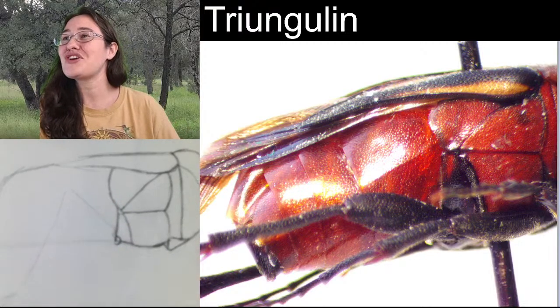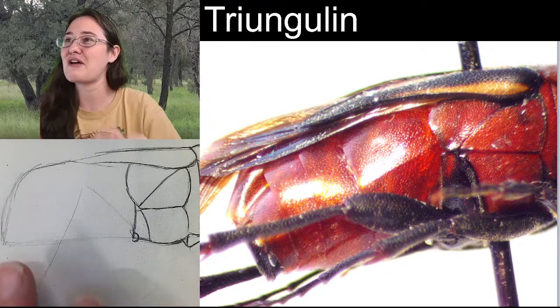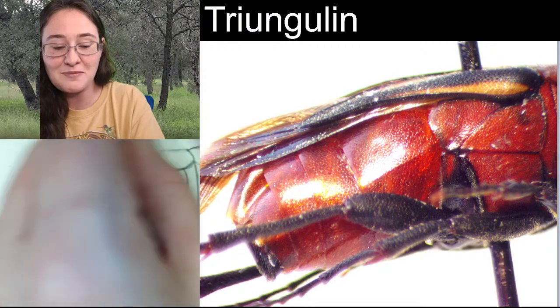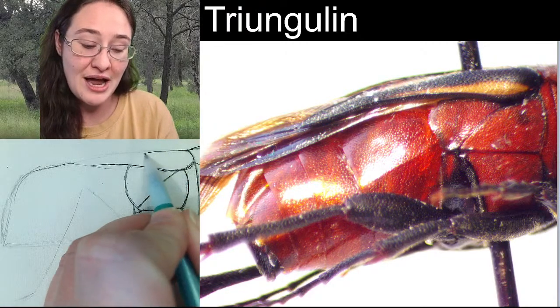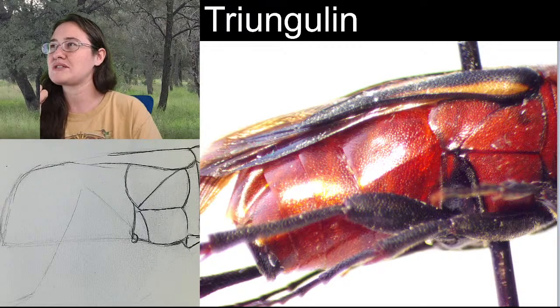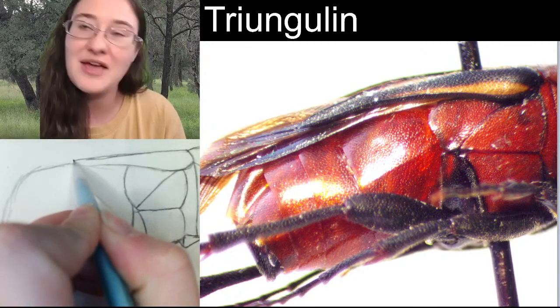And I'm going to start sketching the abdomen while I talk. You guys can see it's focused too, so hopefully you can follow along as I sketch. So we have these triungulin larvae, and they are really itty bitty tiny, and their body shape is adapted specifically for finding their host and holding on, and following them to wherever they're going to be feeding. And I believe that wedge-shaped beetles feed on roaches? I believe that they are parasitic of roaches. Oh, okay, and on a variety of species of bees and wasps. So they'll hop a ride, and then they will feed.